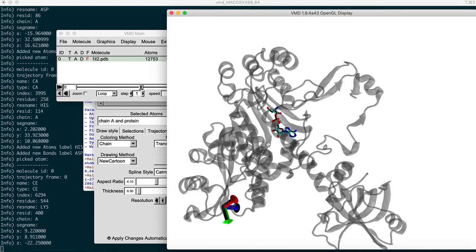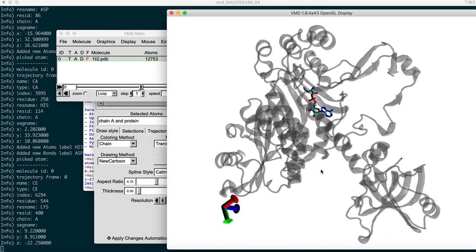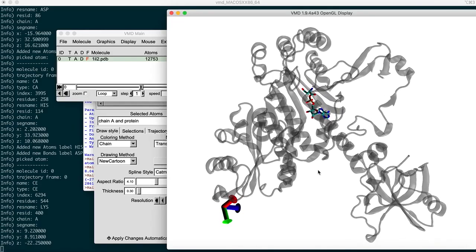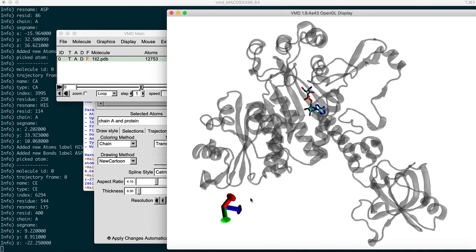Going to position this in the center by pressing T on the keyboard, and just press R again, back to the rotation mode. Also, this is a distraction here, the XYZ coordinates. Sometimes when you take a publication rendered figure, having the XYZ coordinates is useful in certain manner. It depends on what you want to show in the figure, but most of the time, like in this case, I don't think the XYZ coordinates are important here, so we can remove it.